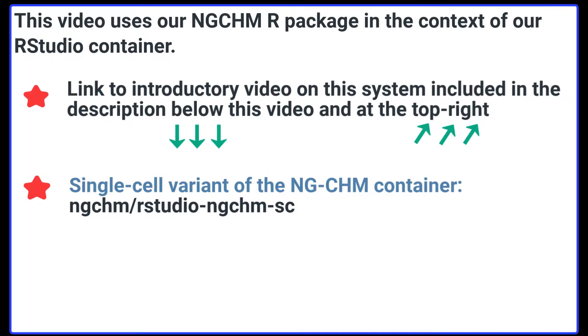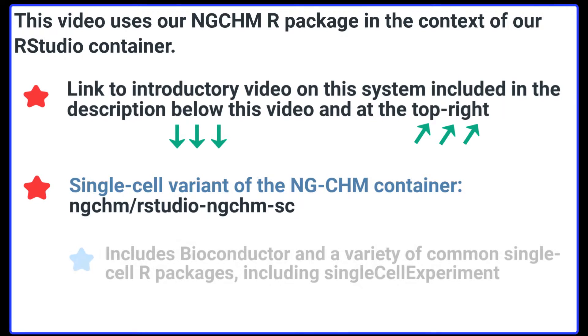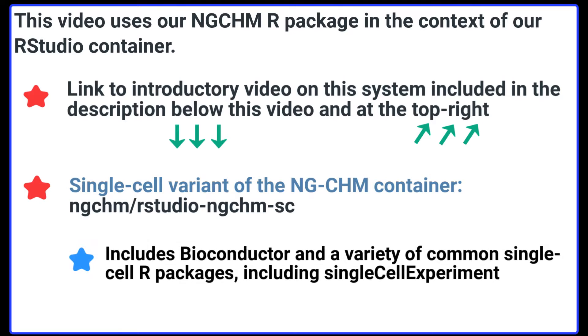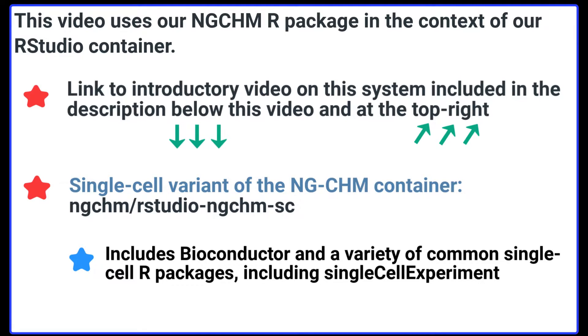Specifically, we are using the single-cell variant of our NGCHM R Studio container. This variant includes the Bioconductor package and a variety of common single-cell R packages, including the single-cell experiment package.